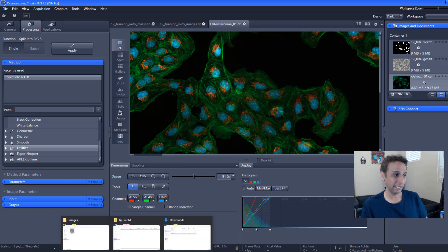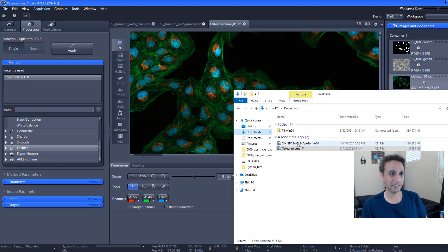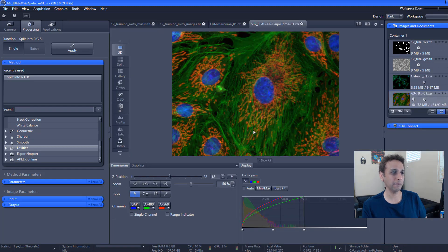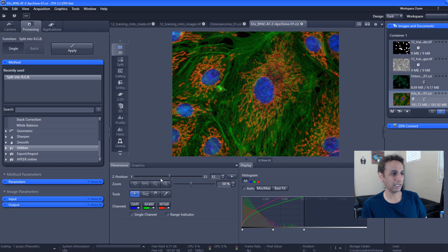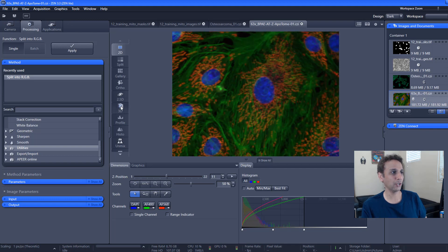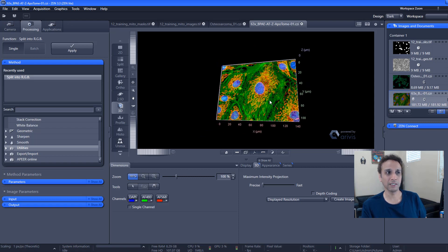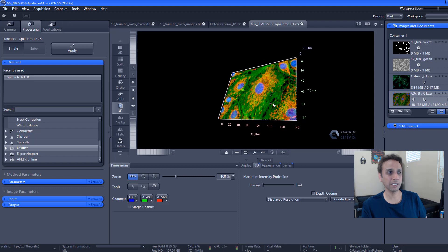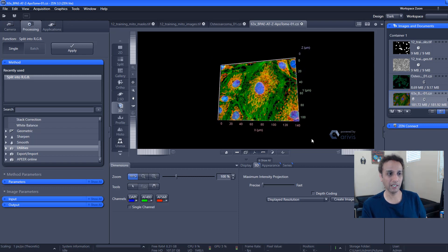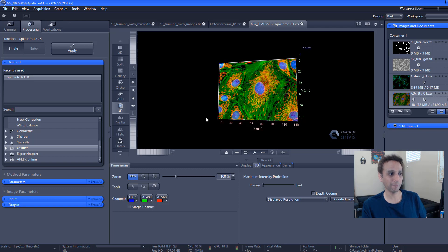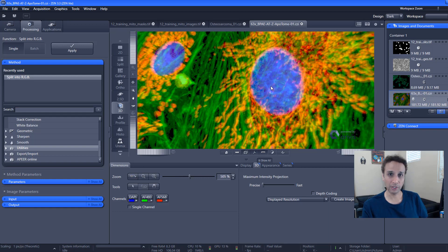One final thing: if you have 3D images, the real reason I use Zen is for 3D visualization. I think this is a 3D multi-channel image — beautiful life sciences images, as you can see. You can look at the Z position by changing the slider, or you can switch to 3D view. It's a very nice free 3D viewer. So if you have multi-channel images, 3D images, multi-dimensional images, or large stitched images, this can be a very nice platform to visualize those images.